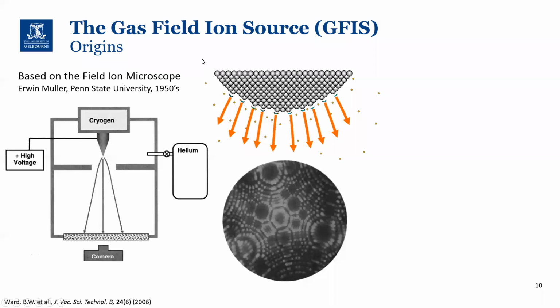So even though the tungsten tip was very sharp, it still had a spherical end form like this. Each one of these little protruding atoms at the very end creates, when under a high voltage, an ionization disk, which are represented by these blue crescents here. Each one of these ionization disks, when the helium approaches close to it, is ionized and then emits radially outwards from the tip. So you can imagine then, if you could actually remove much of the atoms along the side and create an even sharper tip, you would get less of these emission points along the tip.